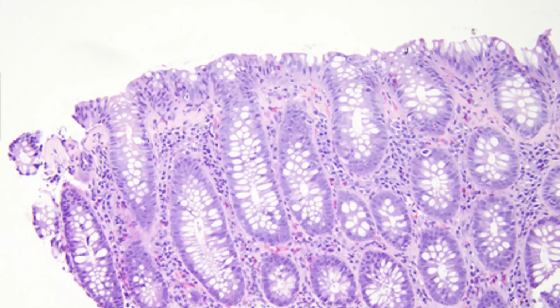So they show this image and they said, because you have increase in the inflammatory cell infiltrate, you have a focal, very focal area of hyalinized collagen. You can see it just at the edge of the biopsy here. Sorry, where, here, look. Can you see this area? You can see that there is thickening of this collagen.